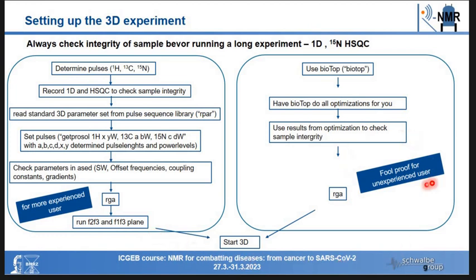Or if you're not that experienced, you would use Biotop, and this is what we just will do in a second. This Biotop is really nice, and I have to admit I didn't know it, just got to learn it. It does all of this, what you can do here on the left side, it does it for you, and it does it in a very nice way. It's not that the user does it better than this program, and you can also look at the results and check if you would have done this the same way as the program. So I would advise to use this because it's really nice.